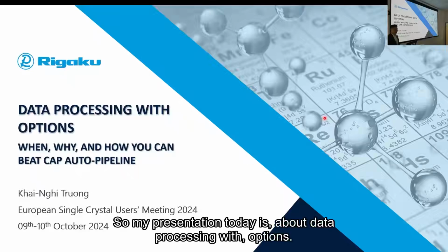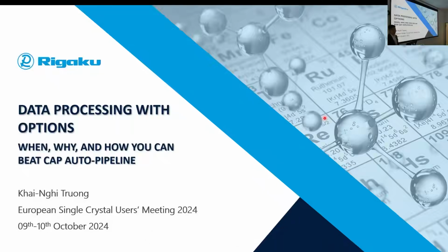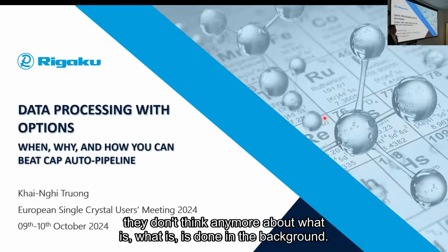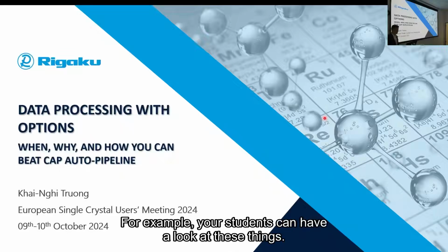Yeah, so my presentation today is about data processing with options. Since we are going more and more into auto pipeline automation, and with newer generations and new users especially, we hear more and more that they abandon a few things. They don't think anymore about what has been done in the background, right? So it is always good to remind, not only you, but also later we will upload these slides in our forum, so that, for example, your students can have a look at these things.